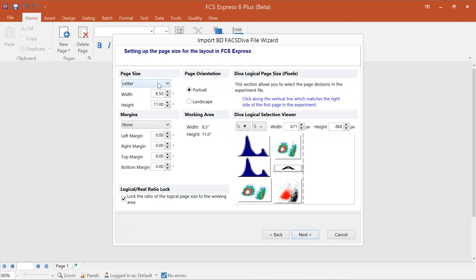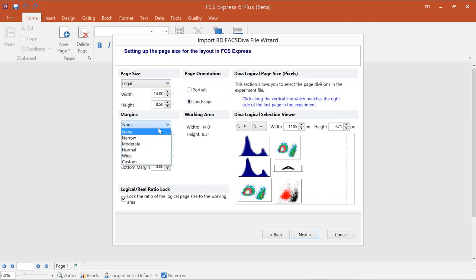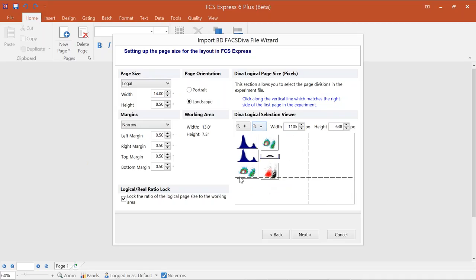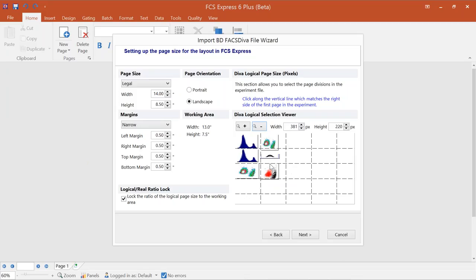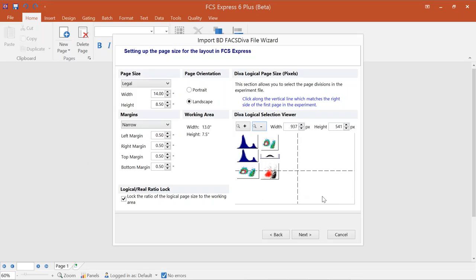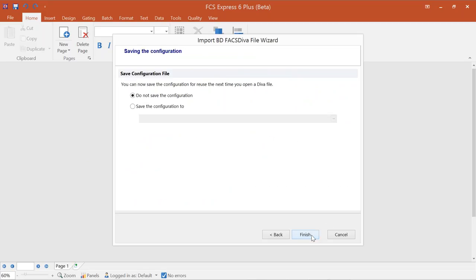Since page layout information isn't included with the exported file, just choose Create a New Configuration and advance to create a new layout. You can choose the page or letter size, defaults, standards, orientation, and margins to make it look how you want. A preview pane shows page breaks, which you can click and adjust. Once everything fits on one page, click Next. You can optionally save this configuration for reuse if you have multiple experiments set up the same way in DIVA — but we'll skip that and click Finish.